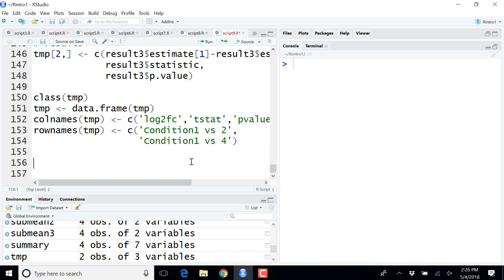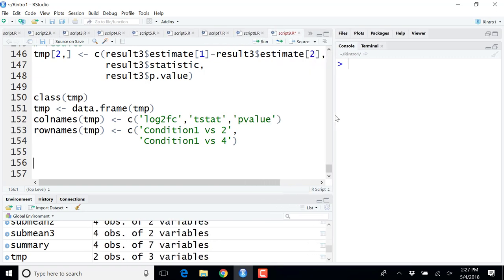So when we filter for particular conditions, if we don't put a comma towards the end, it doesn't give an error, but it doesn't filter either. So how is R interpreting that? If we scroll up, we are filtering for the conditions in one protein.